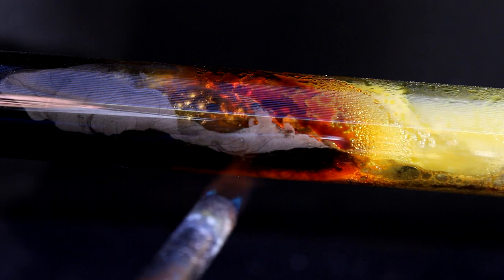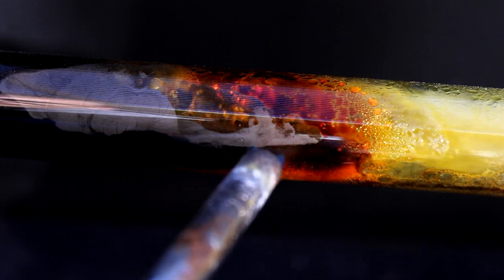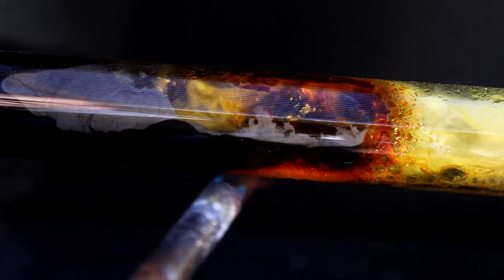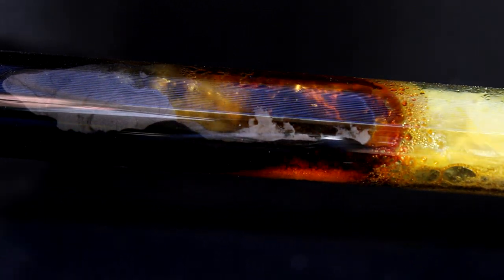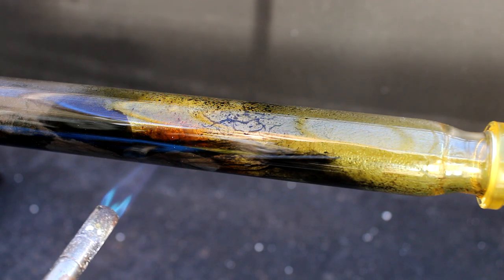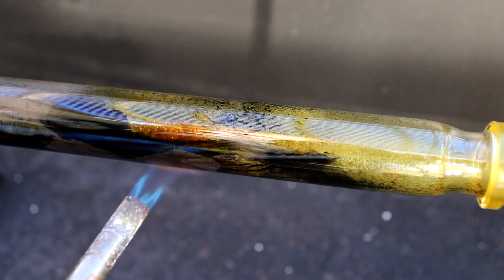Sulfur dichloride is a beautiful cherry red liquid, while sulfur monochloride is more of an amber-yellow color, so it's pretty easy to tell which one you're creating. If you want sulfur monochloride, just redistribute the product in the presence of excess sulfur. Anyways, you'll need to keep heating the sulfur until all of it reacts. This isn't a self-sustaining reaction as far as I can tell, and constant heating of the sulfur is a must.